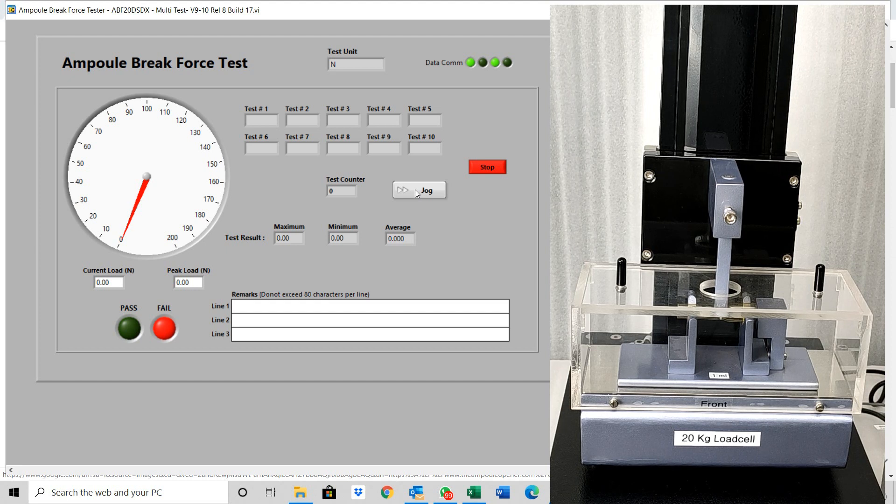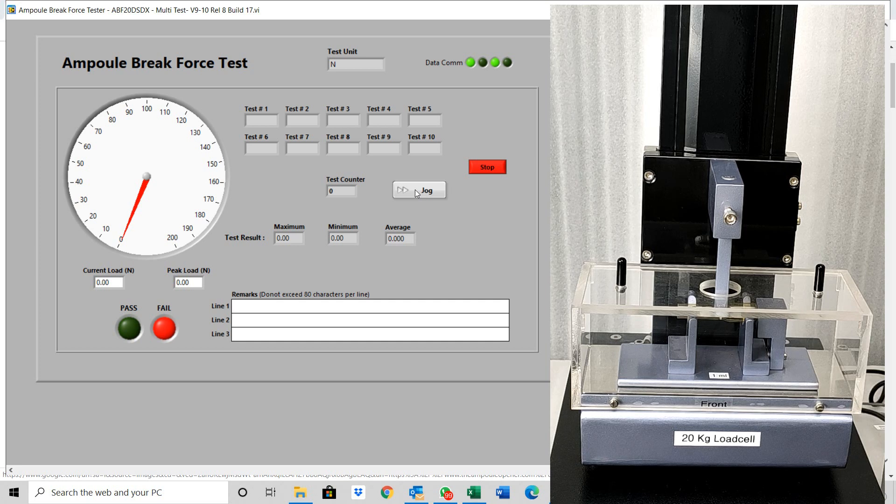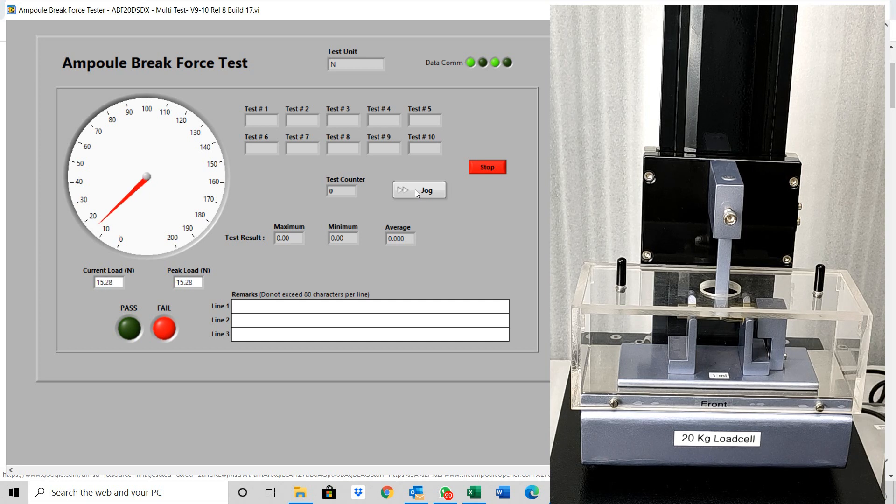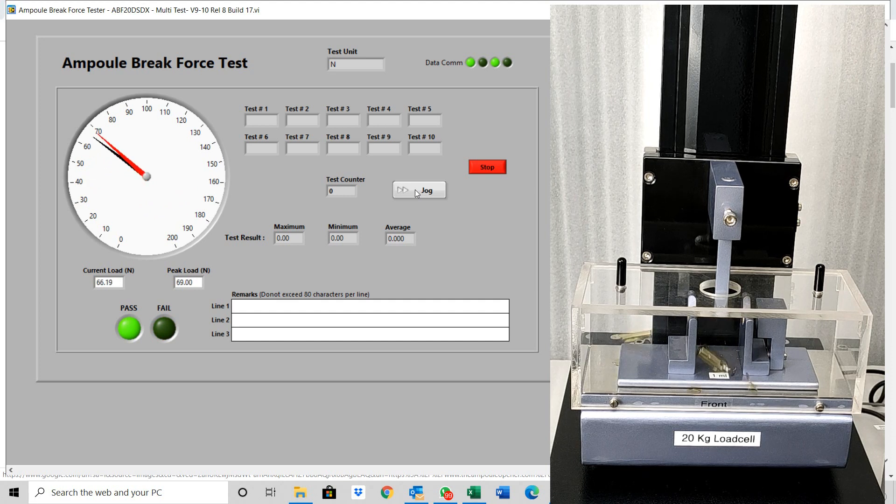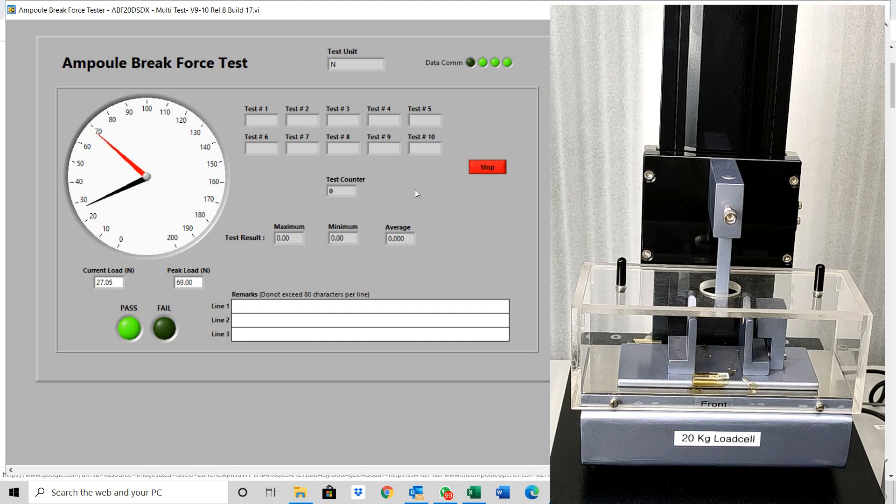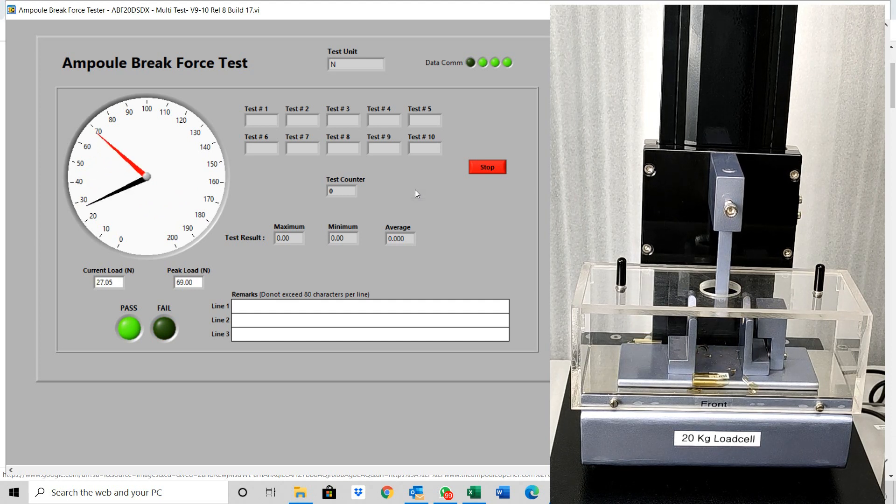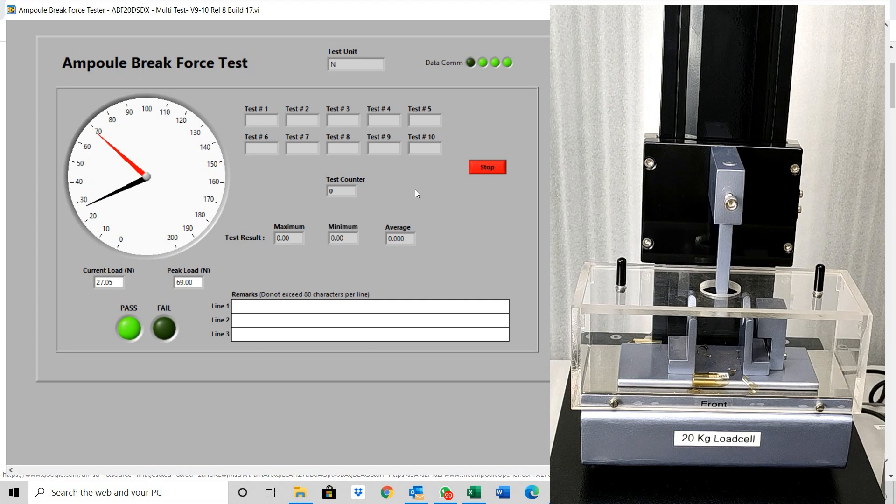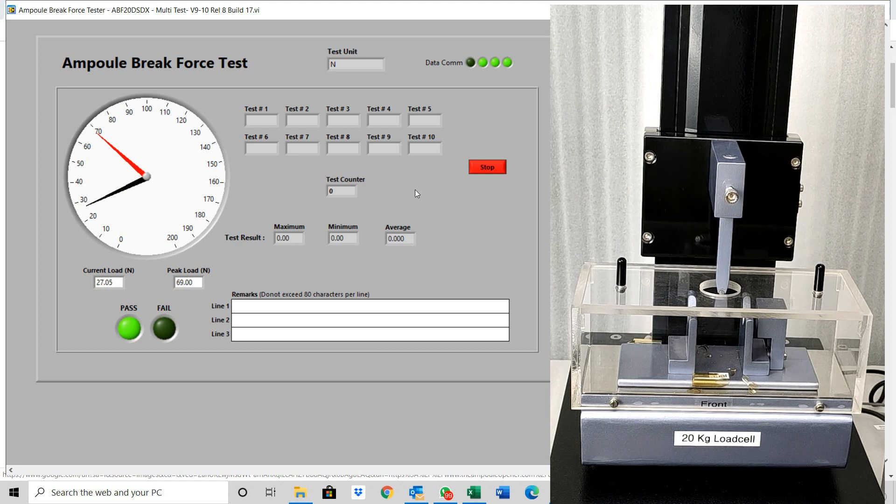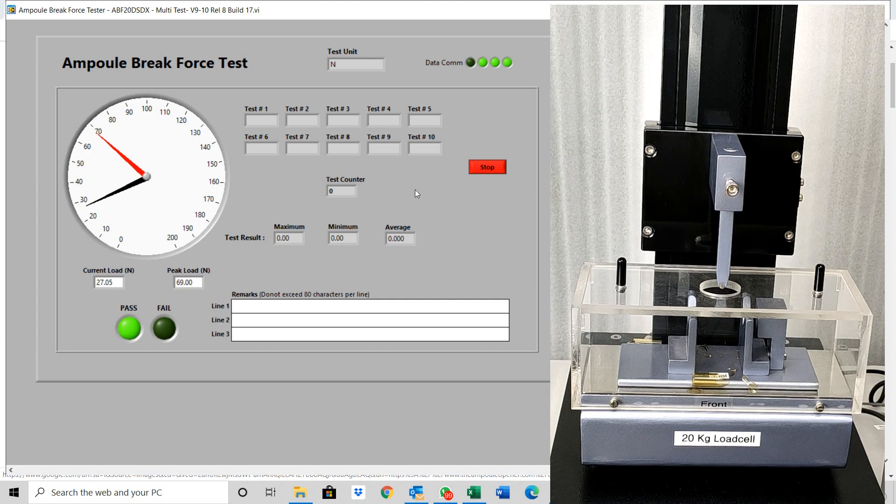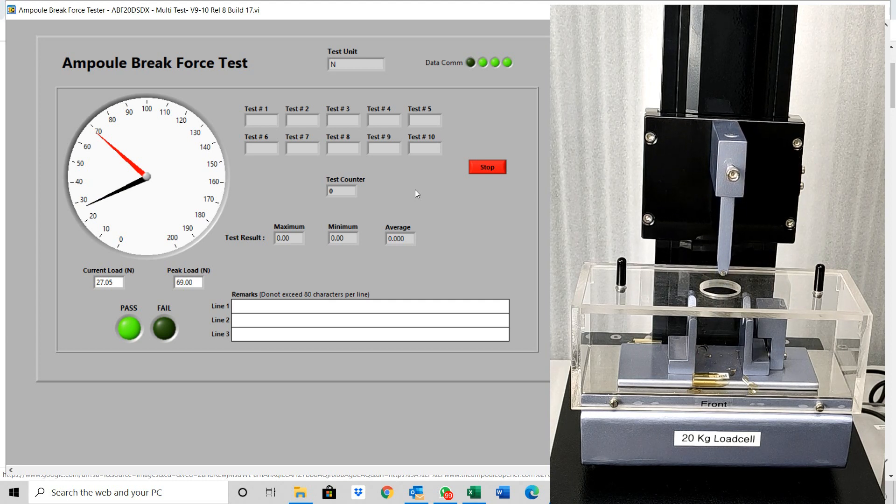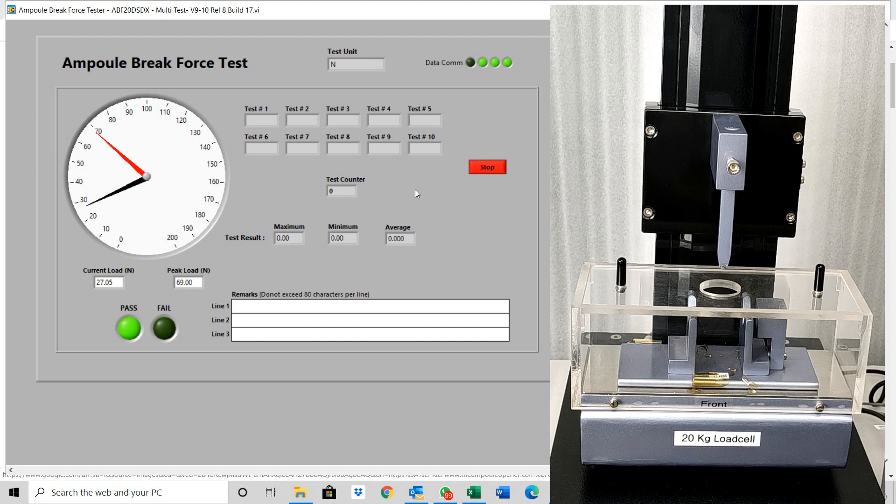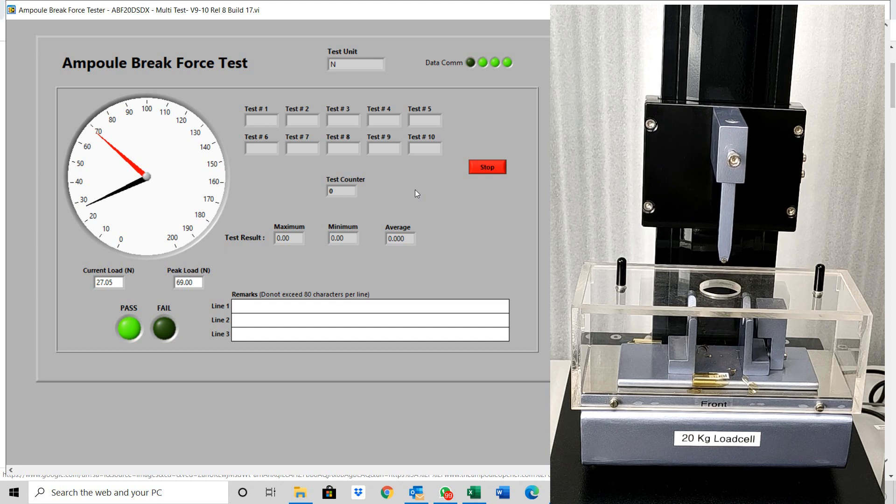The force being exerted on the ampoule will be shown on the dial on the software screen. As soon as the sample breaks, the machine will auto stop and return back. It will show a test completed sign.